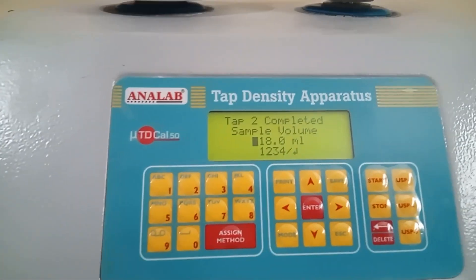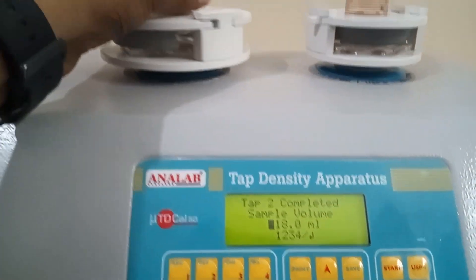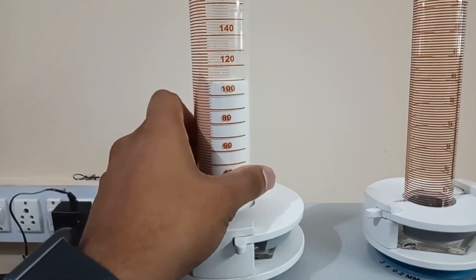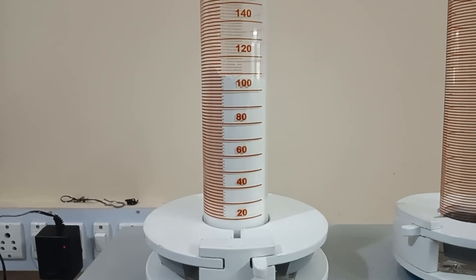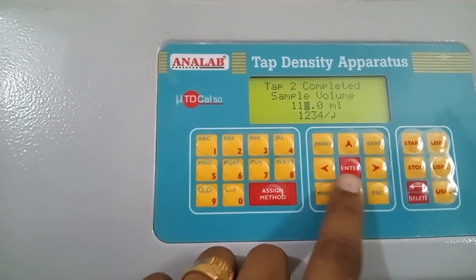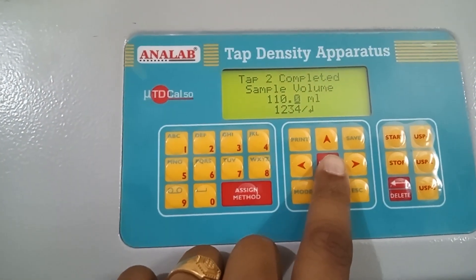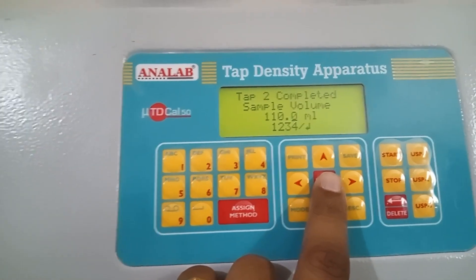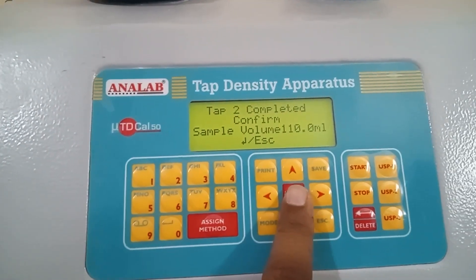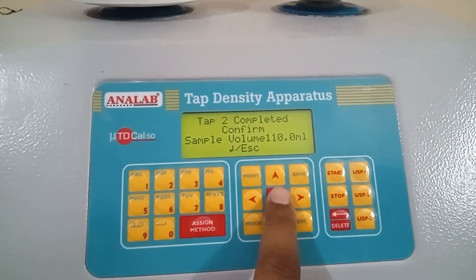The instrument has done 150 tabs. Now it is asking to write down the volume. Let's note the volume — as you can see it is 110 ml. I will mention the same. This process will go on until the difference between the volume is more than 2 ml. Once the volume difference is less than 2 ml, then the next step process will not be asked. I will press the enter button so the next number of tabs will start.